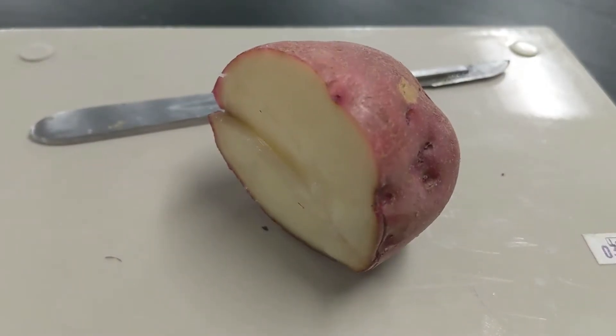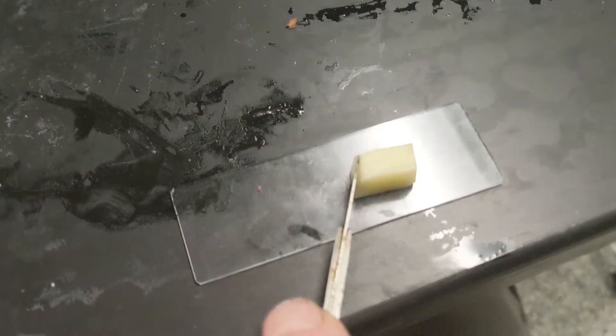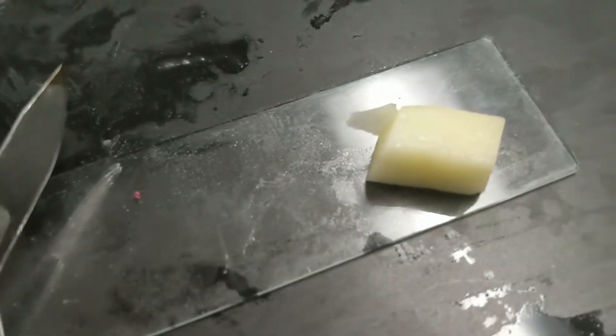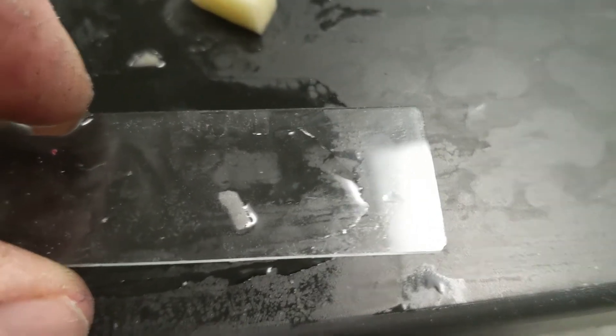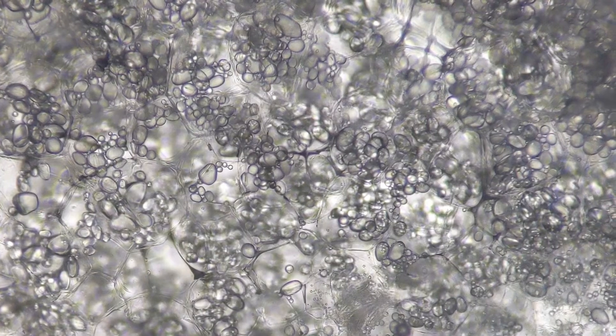But let's use real cells. In this case we have a potato, and we chop the potato up into a manageable cube. We're going to take the thinnest potato chip you can imagine off of there, just a couple of cell layers thick, and put it on a glass slide with some water and get it under medium power on the microscope.